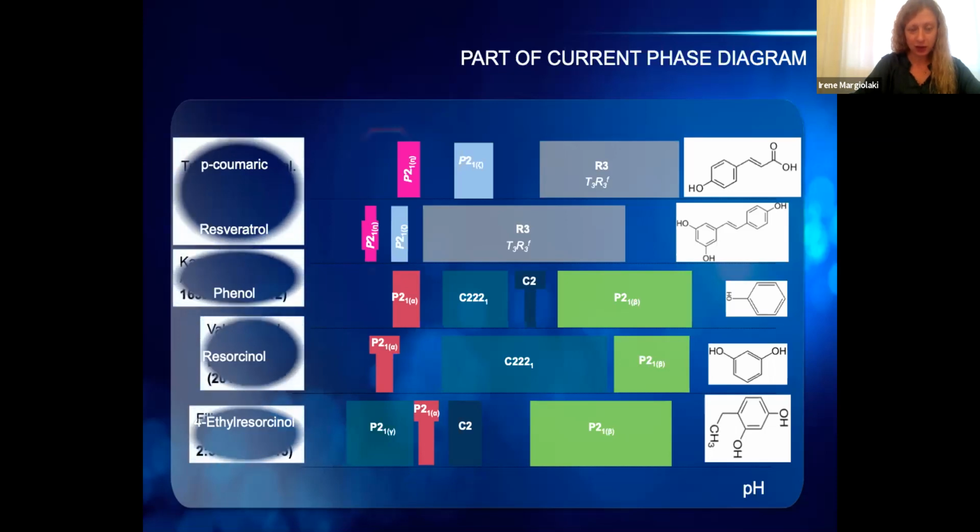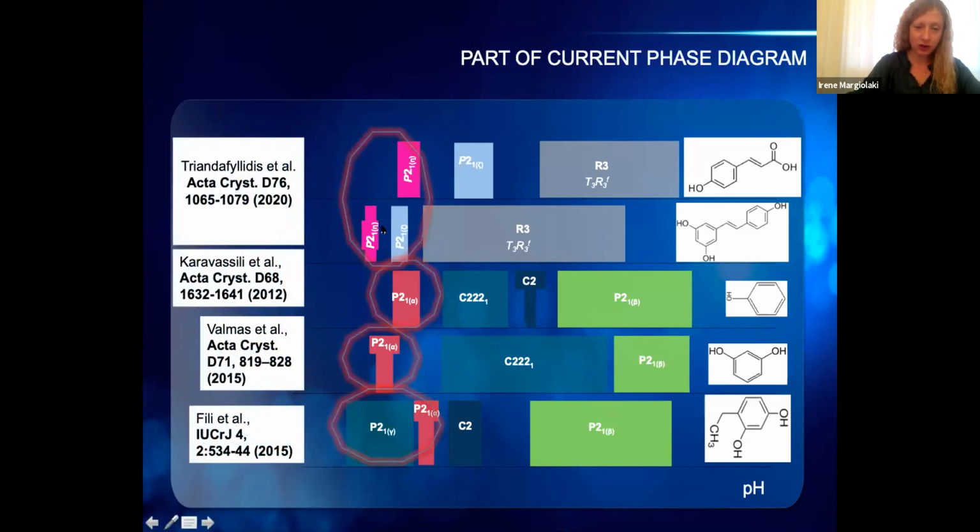And the second surprise is that all these phases correspond to the same space group, P21, it's monoclinic. However, as you can see, we denote them with alpha, beta, gamma, delta, zeta, and so on, because they are different crystal forms. These 7 forms were identified by our team, and here you can read more about them.